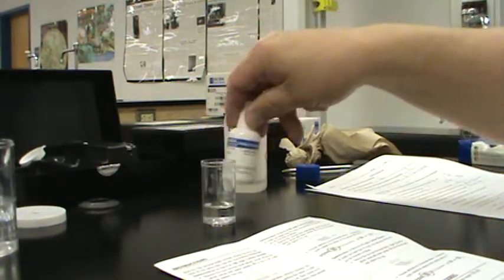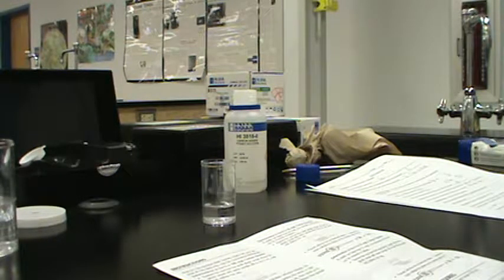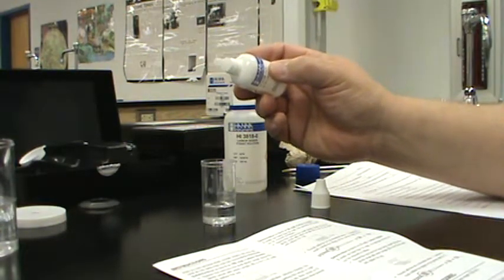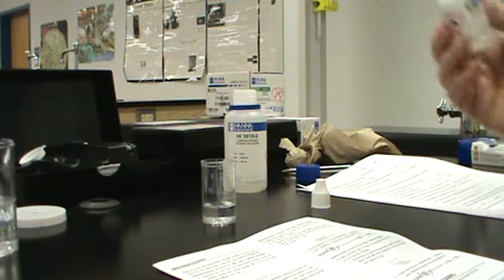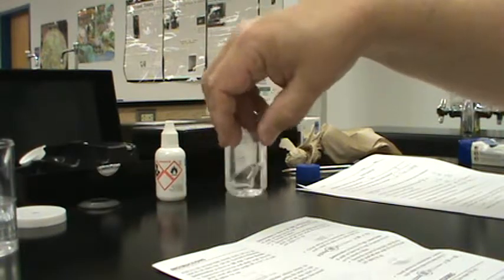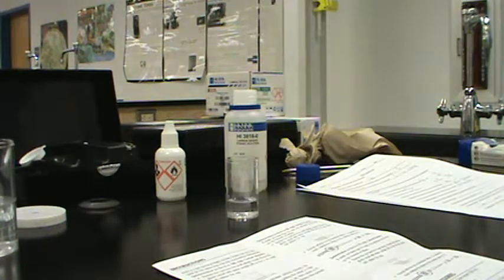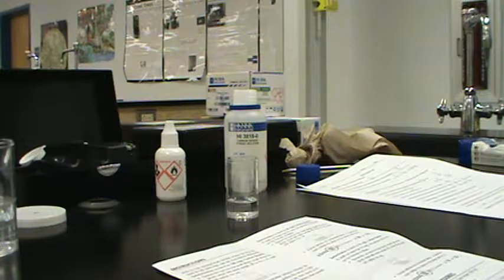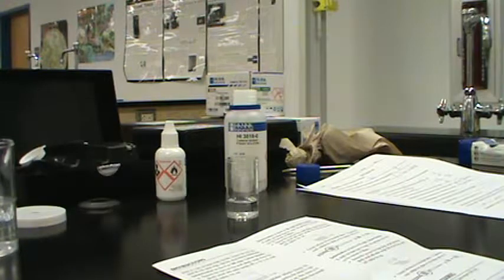We're going to add one drop of our phenolphthalein reagent. Here's what we're looking for: does it turn pink? We added one drop and we are going to swirl. I'm not seeing it turn pink. It says if the solution is pink or red, then record as zero milligrams per liter of carbon dioxide. If the solution remains colorless, proceed to the next step.